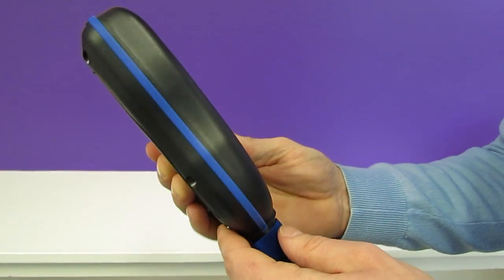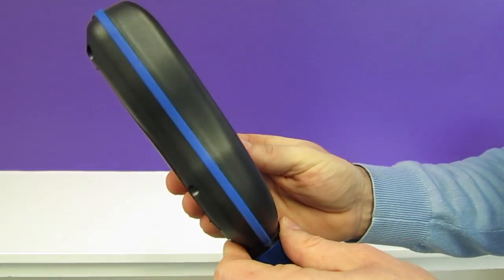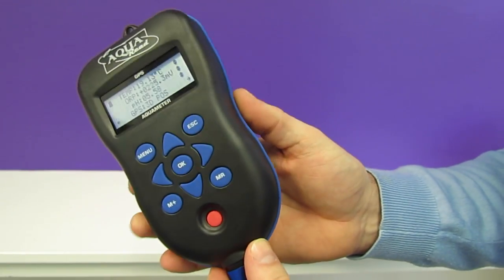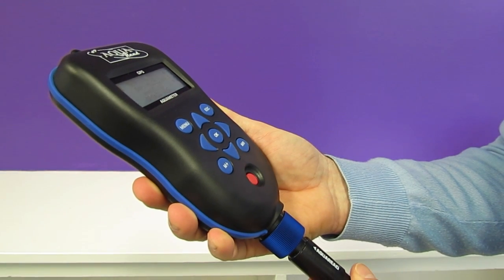The meter can be used with all of our AquaProbes, ranging from the AP Light right through to the AP 7000. The meter itself is IP67 rated, making it perfect for use in the field. The meter is the ideal choice for your portable water quality monitoring.